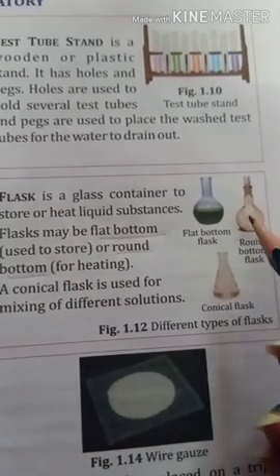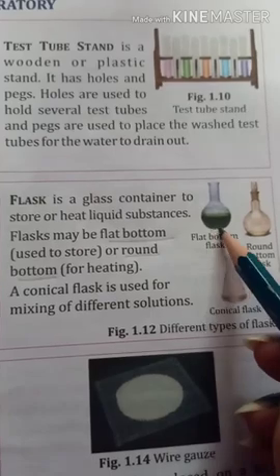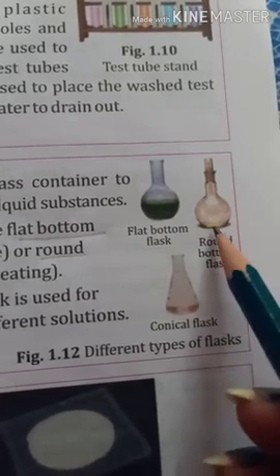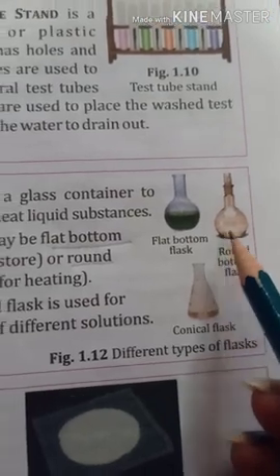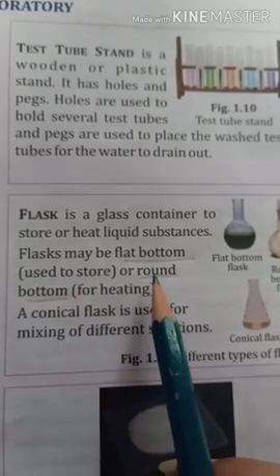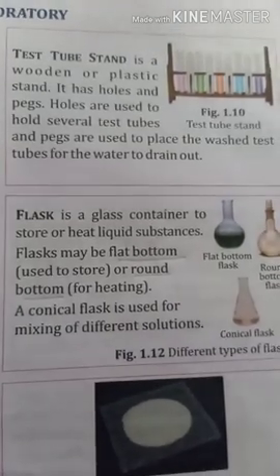Here you can see we have a flask with flat bottom. The bottom of this flask is flat. So similarly we have a flask with round bottom. The bottom of this flask is round. Now this flat bottom flask is used to store liquids, and the round bottom flask is used for heating liquids.